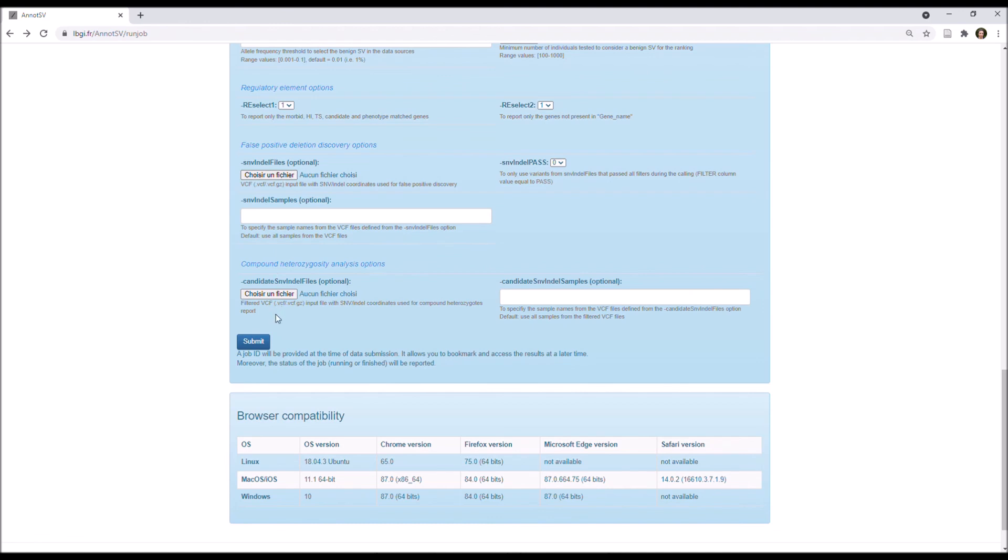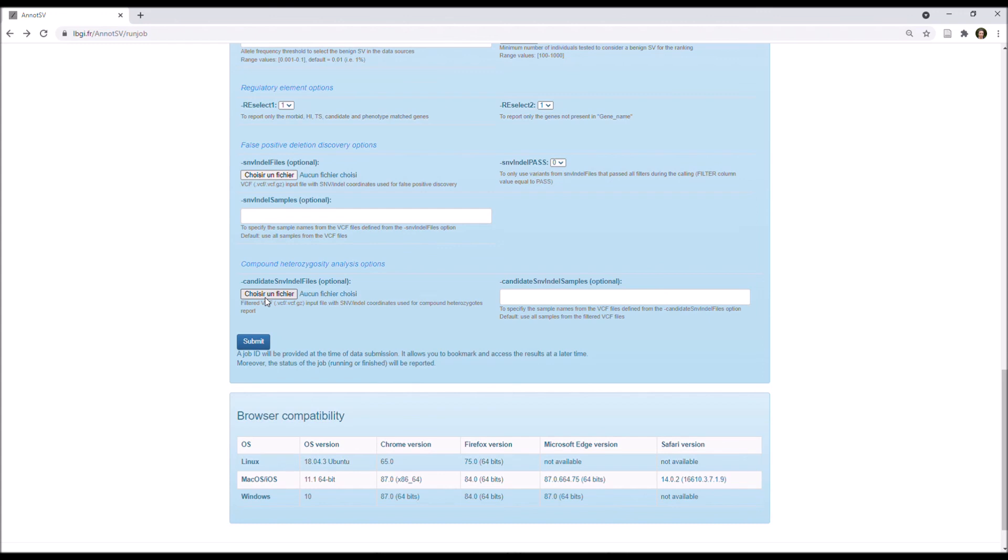And finally, you have options specific to a compound heterozygosity analysis. So, here, you can upload a VCF input file with the SNV-INDEL coordinates from your patient, I mean a VCF that is already filtered for genotype, frequency, and effects on protein level. And so, AnnotSV can report the heterozygous SNV-INDEL called in the gene overlapped by the SV to annotate.